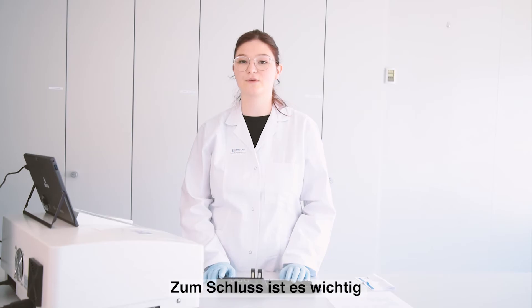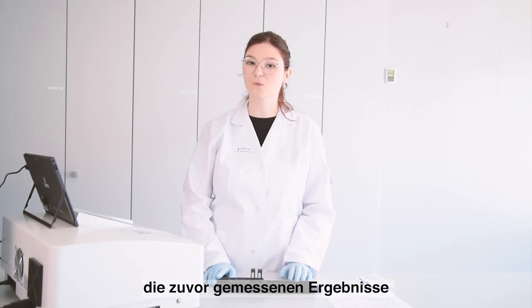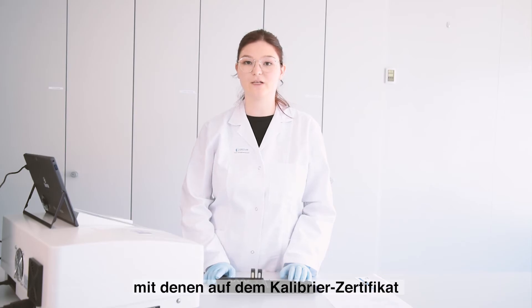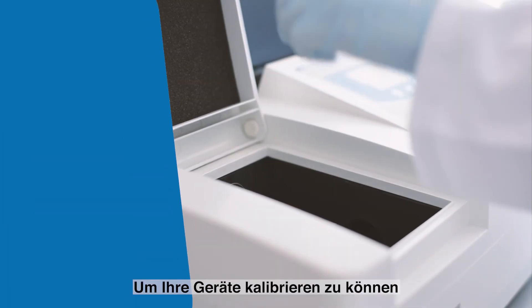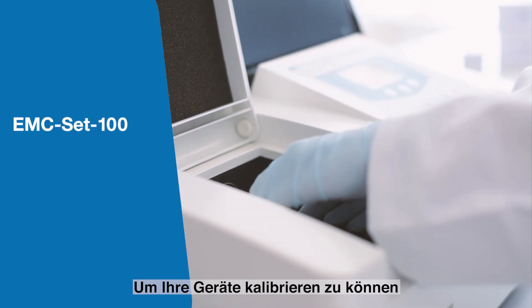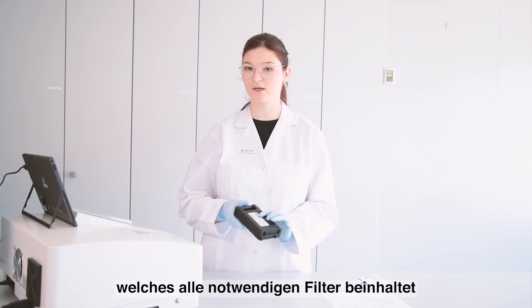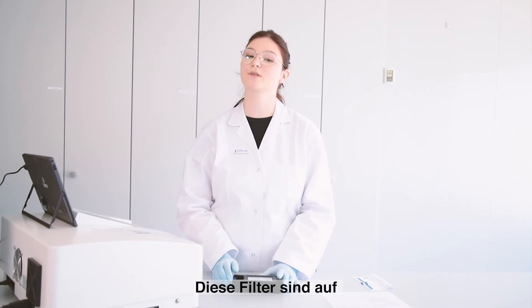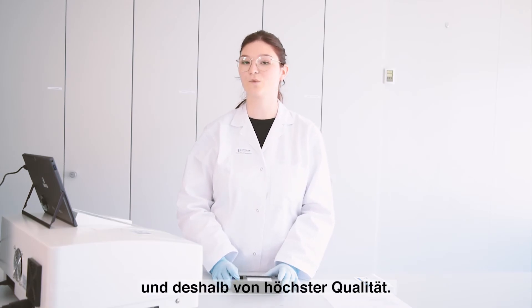In the end you should compare the results you received through the PC software with the certified values listed on the calibration certificate. To carry out the calibration, we offer the EMC set 100 with all filters necessary, and the filters are certified products and NIST reference material, so they are of high quality.